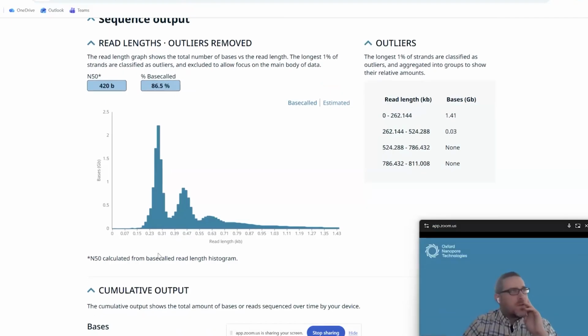If it influences your decision, in one of the papers from Billy Lau and his group, they are using the SUP models, super accuracy, for their base calling. Yeah. So Matt, like Daddy's lab, like Tim's lab, they have P2 Solo.